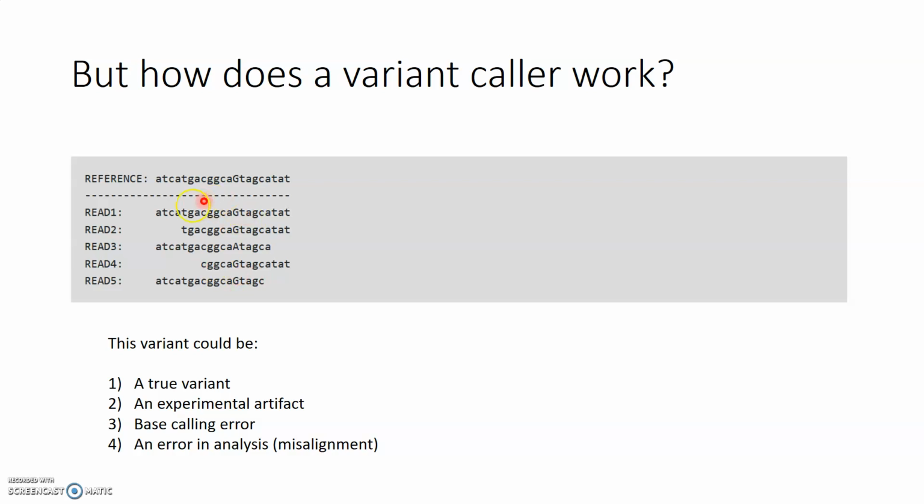In this case, we have 5 particular reads, and this type of thing where we have a number of reads stacking up to our reference is known as sequencing depth. If I ever ask the question, what's the sequencing depth at the capital G allele here, you would say 5x, right? There are 5 reads that are aligning to that particular spot in the genome.